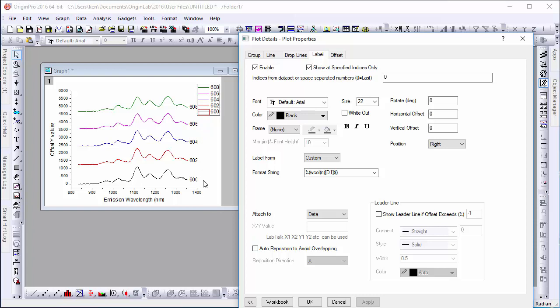To add units to this legend, in this case, nanometers, go back to the Format String and add your label after the format syntax.